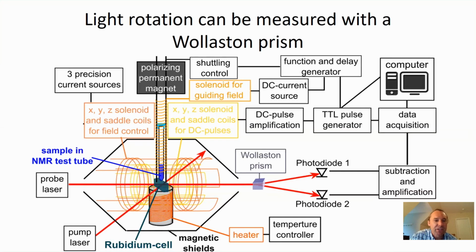In this particular configuration, we used to heat these rubidium vapor cells to almost 180 degrees, which is of course very hot, and so we needed good thermal insulation. But one advantage of cesium, for example, is that you can operate it at lower temperatures.